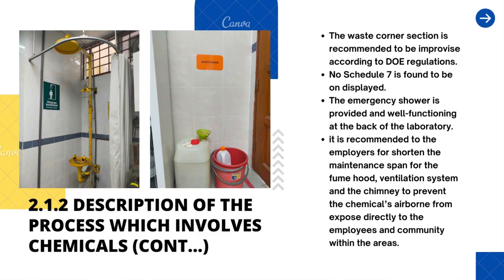Next, for the continuation of the process description involving chemicals, the waste corner section is recommended to be improved according to DOE regulation. From our walkthrough inspection, no Schedule 7 was found on display. Next, the emergency shower is provided and functioning well at the back of the laboratory.